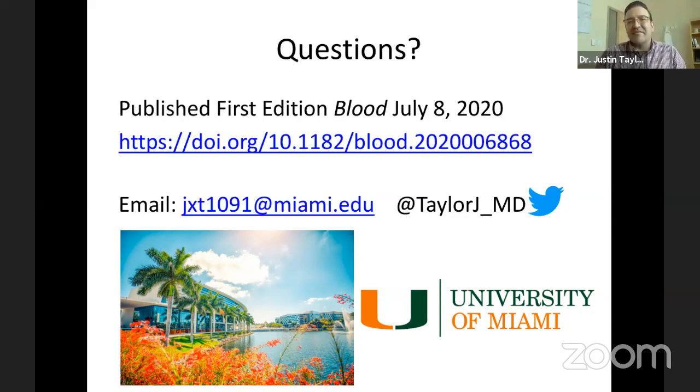And so it saves a lot of time. With the number of cells you're able to do as compared to just counting 100 colonies, you're able to do thousands of cells. So it is probably also more accurate.